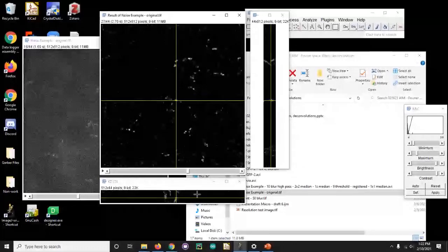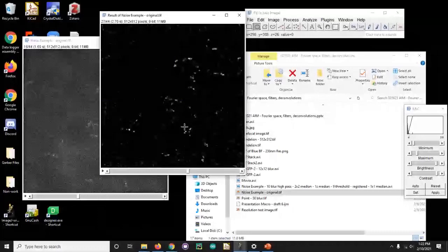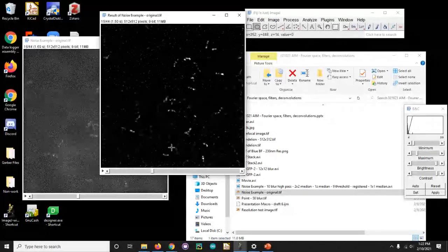So in the Z projection, or the time projection, the background is being modulated at a very high temporal frequency, but a real signal is not. So you can be like, aha. We might be out of options in the space domain, but we still have the time domain that we can use to our advantage to remove this background.